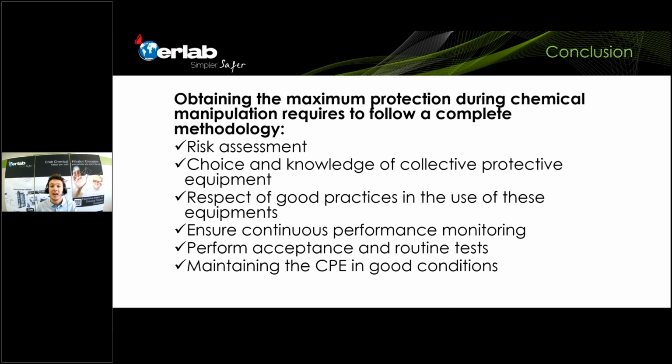the things that you do in the lab, but never overestimate as well. Never be too enthusiastic about all the safety that you have in the lab. I think there can always be something that can be done better in the lab. So yes, do a risk evaluation. It's a subject, it's a topic that will always come back.